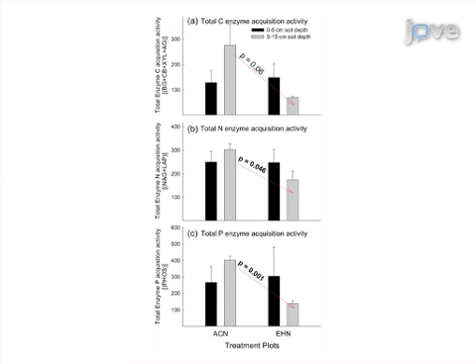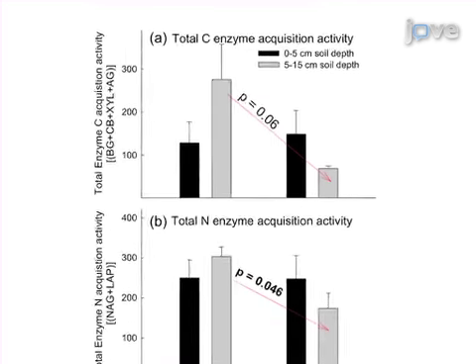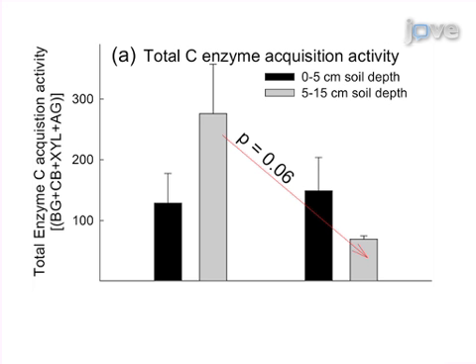Calculating and plotting the sum of all carbon, nitrogen, or phosphorus cycling potential EEAs can be a useful approach to observe broader patterns regarding potential soil carbon, nitrogen, and/or phosphorus cycles. In this example, the sum of beta-1,4-glucosidase, beta-D-cellobiohydrolase, beta-xylosidase, and alpha-1,4-glucosidase potential EEAs was calculated to represent potential carbon cycling activities.